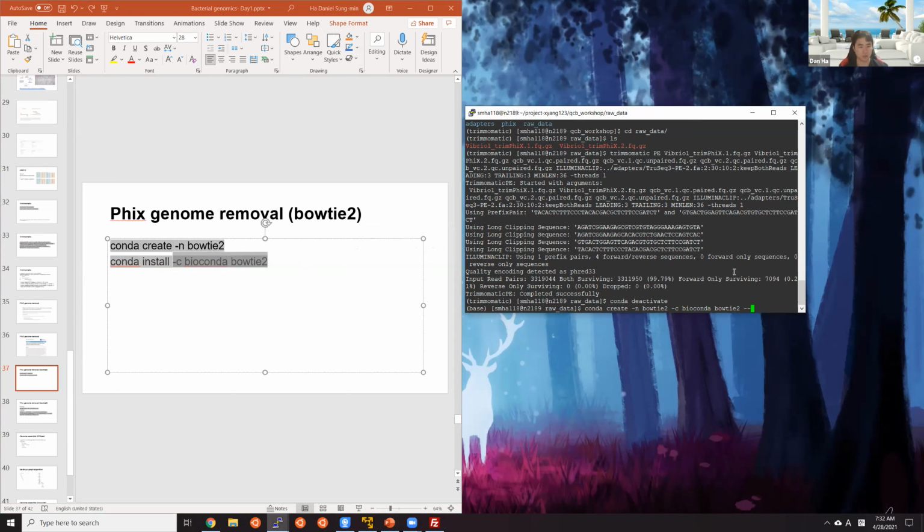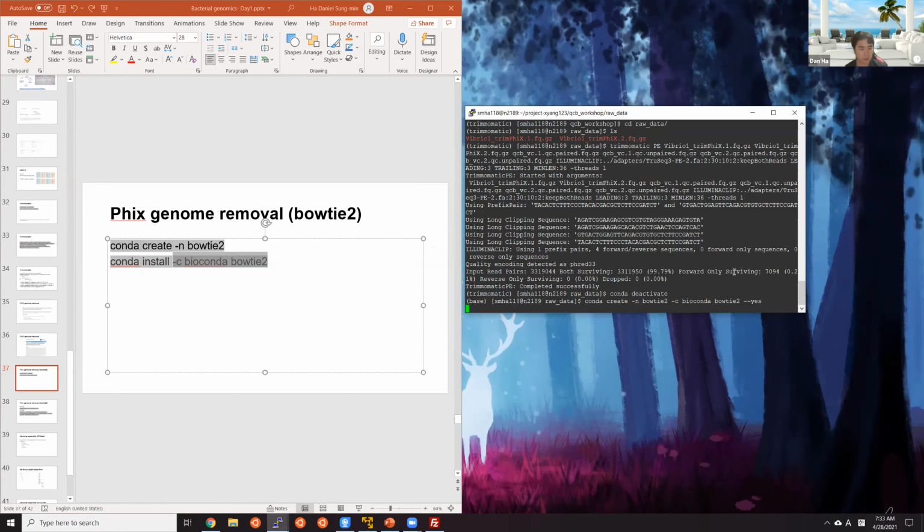And then you can type in --yes to say yes to every prompt that is asked, and then press enter.